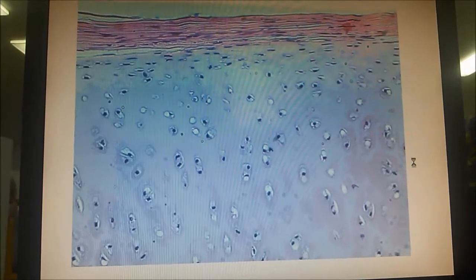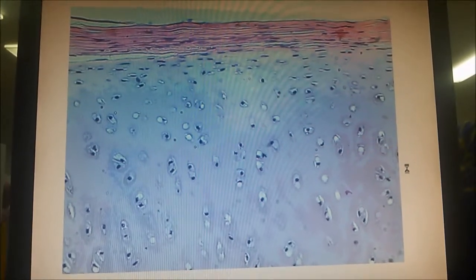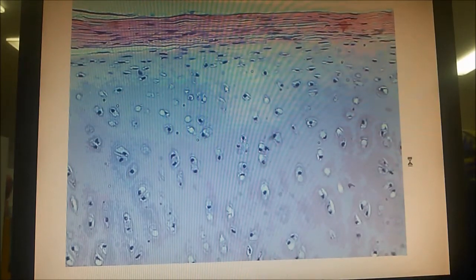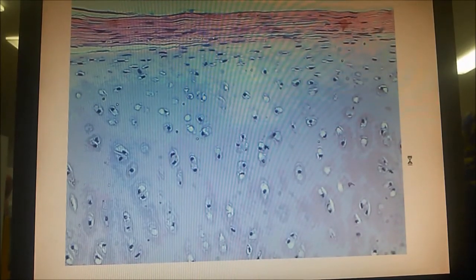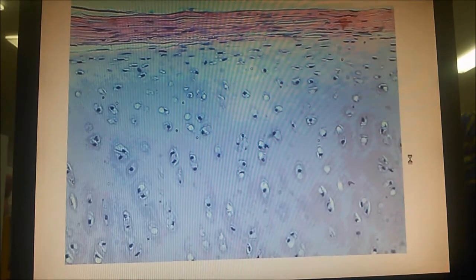Why is it named like that? The hyaline cartilage is the most common type, which you see around the trachea and on the surface of the bones in the joint. The matrix in the hyaline cartilage contains two main structures: ground substance number one and collagen type 2. The ground substance and the collagen type 2 have the same refractory index. The term refractory index means how light is refracted as it passes through the matrix. If you have something composed of multiple components that share the same refractory index, it will always appear transparent. It will look glassy. Did we understand why the hyaline cartilage looks glassy? Due to the composition of the matrix. Collagen type 2 and ground substance have the same refractory index, so it appears transparent.